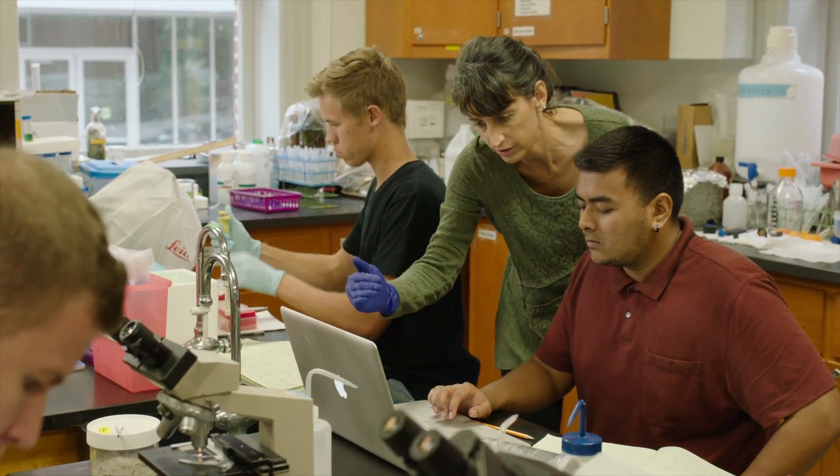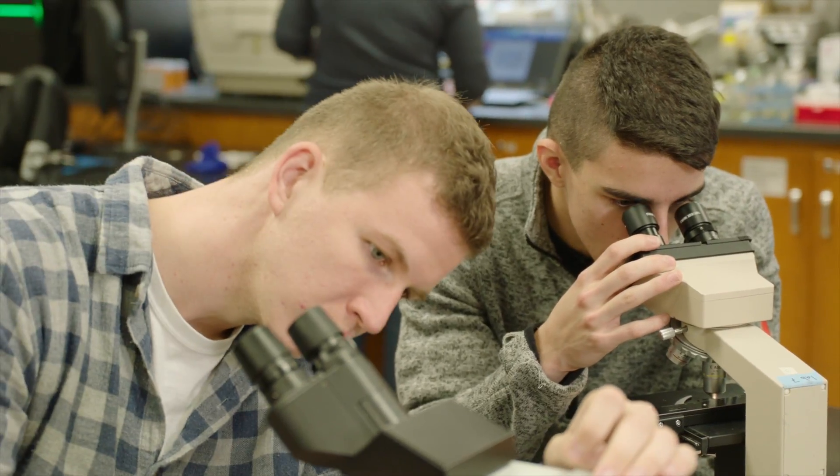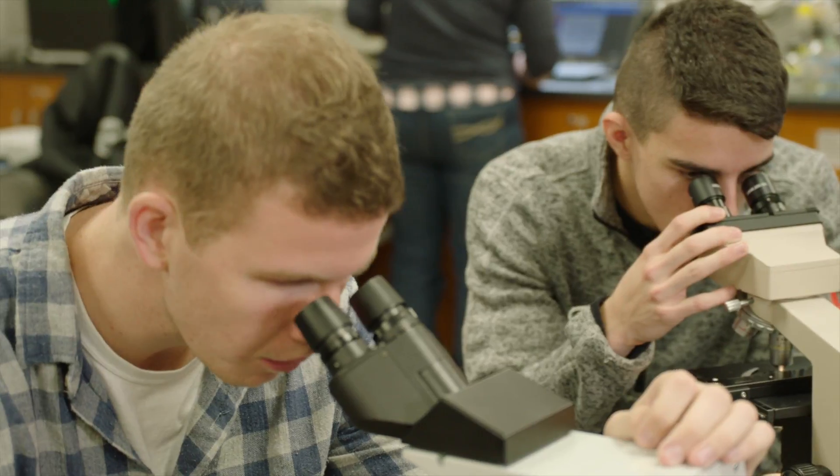It's bringing science to a community that may otherwise not have been exposed to this. Being in this new building, in this collaborative atmosphere with several different departments, and having the drop-in lab where they can see us working on the MiniSeq, it's going to open up real avenues of communication and respect and understanding. Having the MiniSeq really brings all of those things together and helps them develop all of those skills which will, in the end, help them get jobs in industry or in academia in the area.